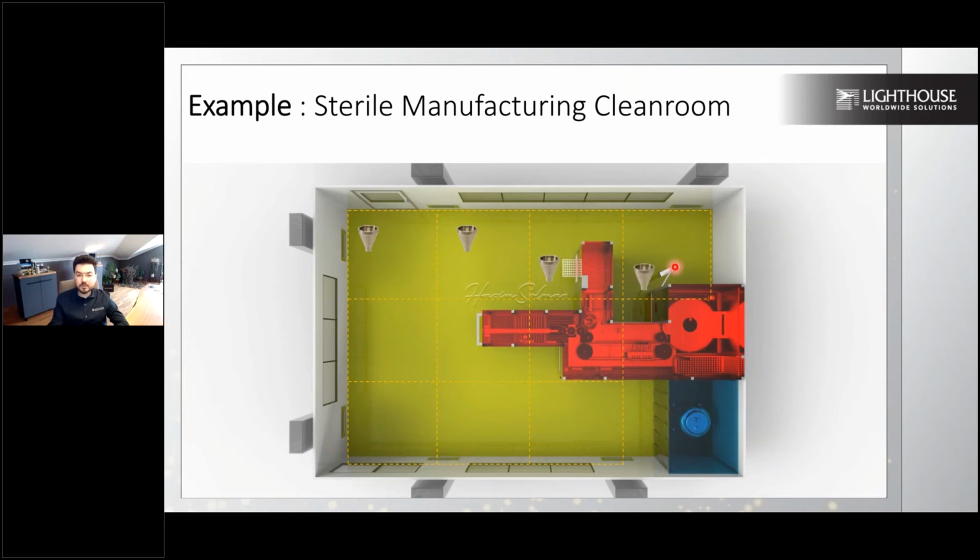Number 4, as you see here, is nearby the operator's zone. My operators, through the RABS system, are using gloves and moving around, also using this touch screen. So I want to make sure that this location is giving the right limits.